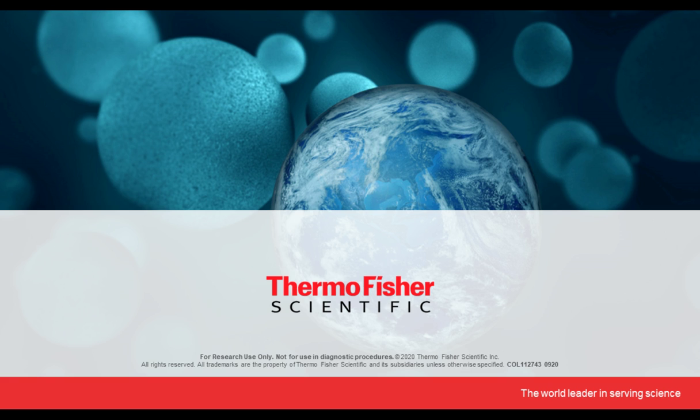In our experience, this reagent binds to about 30% of lysine residues in a protein. So it doesn't bind to every single lysine, but it does bind to about 30%, which is still a good number of lysine residues to make sure that the signal is strong and the detection limit is pretty high for this reagent.